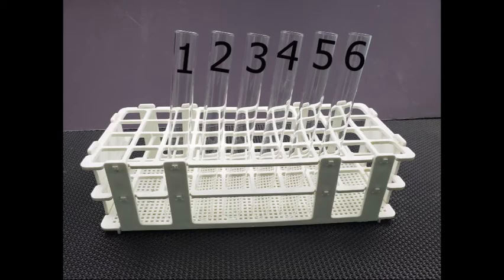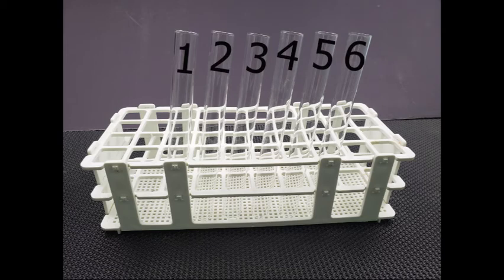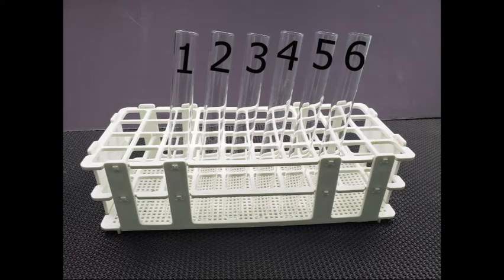Procedure. Use the marker to label six test tubes one through six. Place the test tubes in numeric order in the test tube rack.